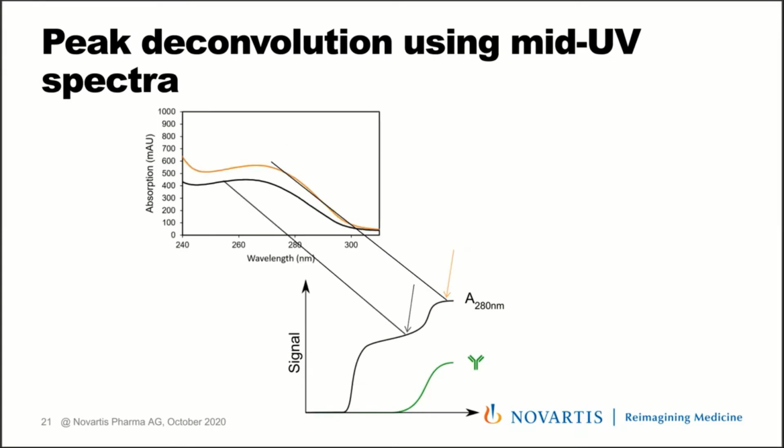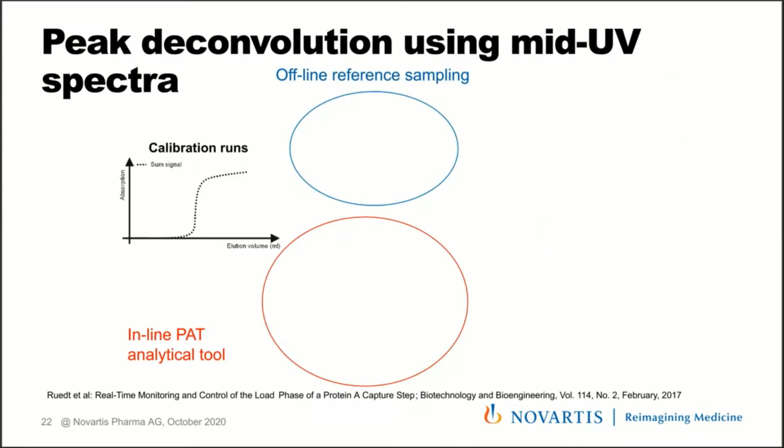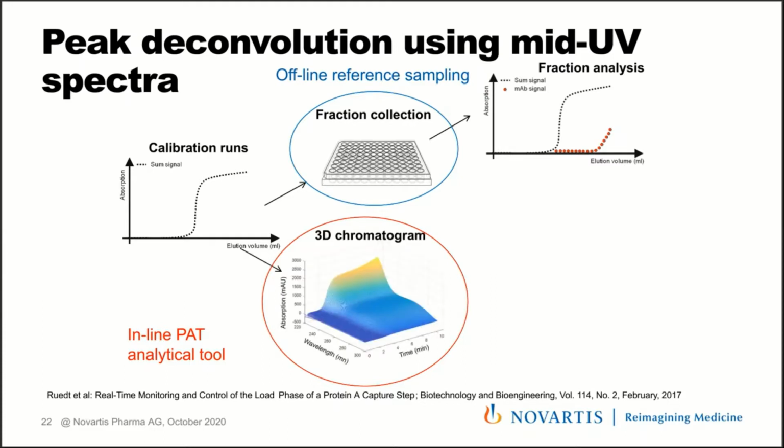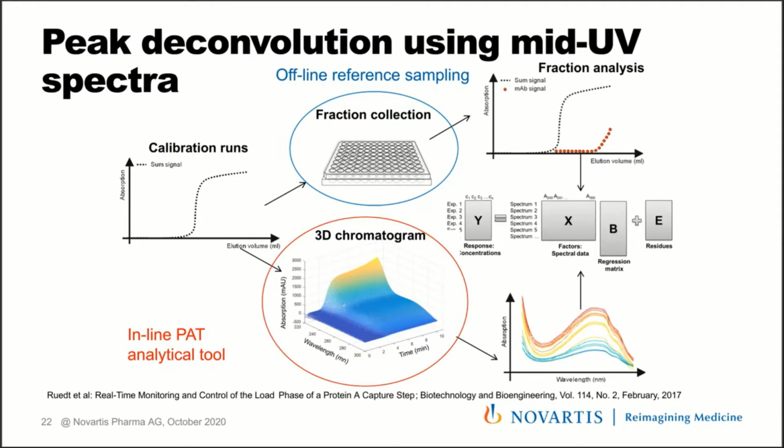So in collaboration during the Horizon project, we assessed what's really happening inside. We collected offline measurements from the samples in the fractions, and then we get this kind of output. Again, we use the UV signal and measure the whole spectrum. At that time, we get this kind of dependence, and with that you can model and get the outputs. This is from the UV, but we already know that the UV doesn't give you the full spectrum and doesn't give you really details. It's mostly what you get from the UV.